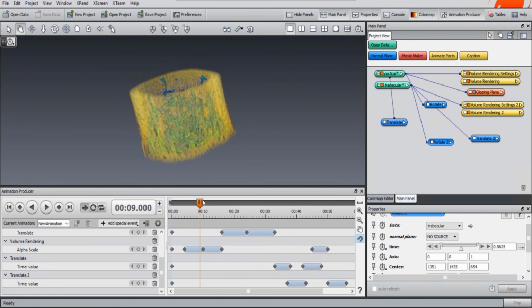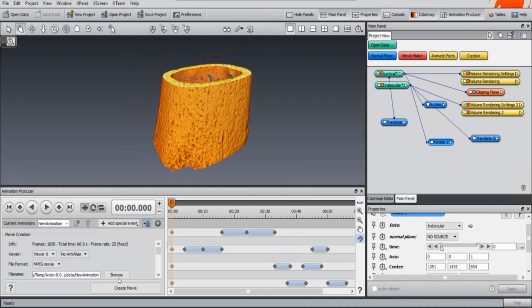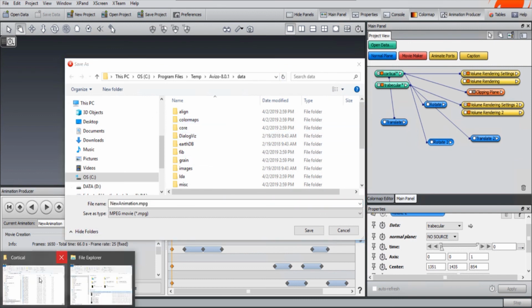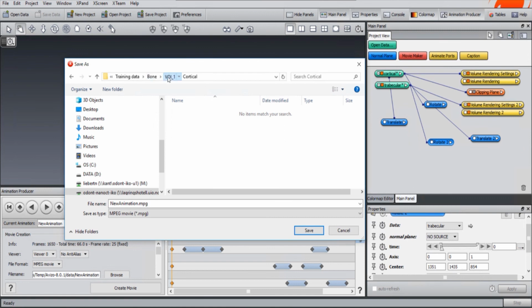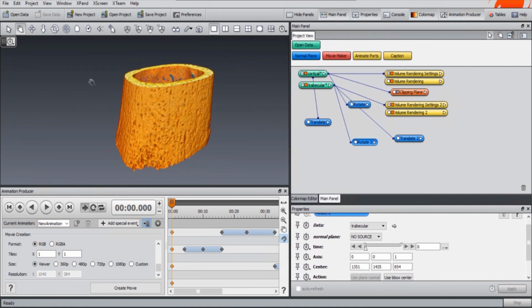Okay, now let's render the video and see if it's going to be okay. Remember that when you want to render, you come here and then you can choose where you want to save it, and I want to save it in the same place, so I'll have it here. And remember to change the name. And here you have some options, but I want to keep resolution as the viewer, so this is the size of your video. There is a lot of things on the sides, I don't want to keep this, so if you decrease like this, it's going to adjust.